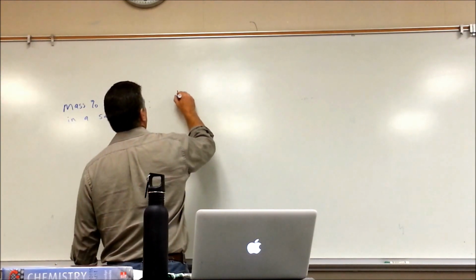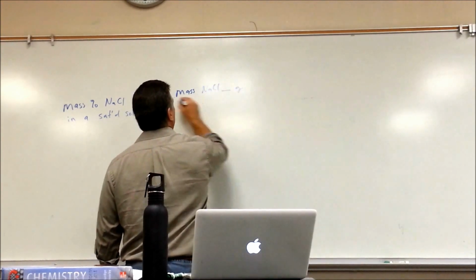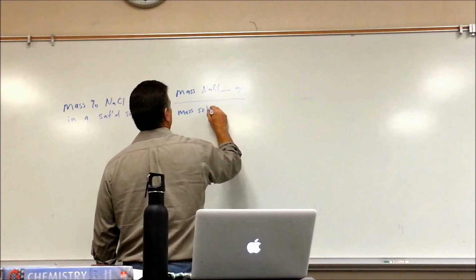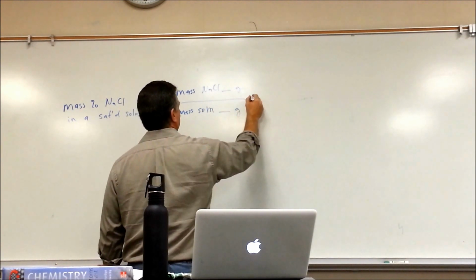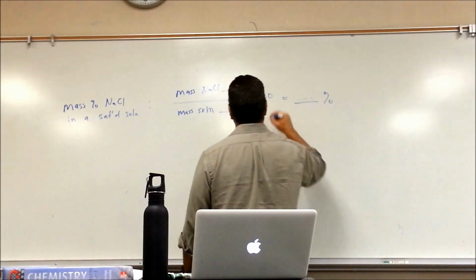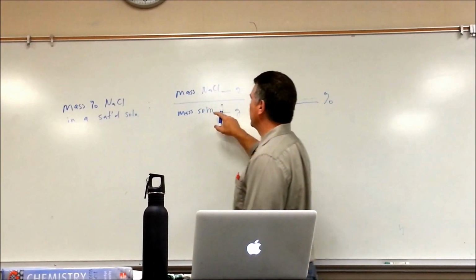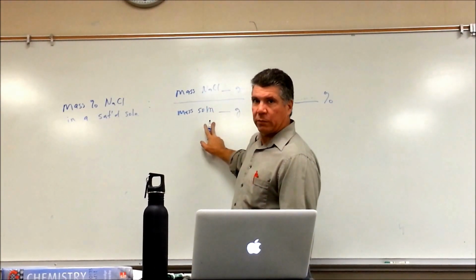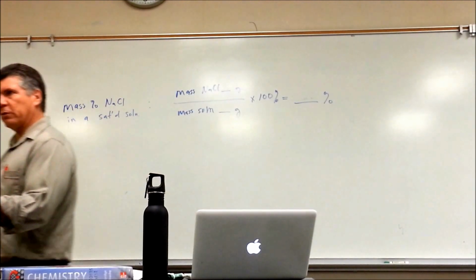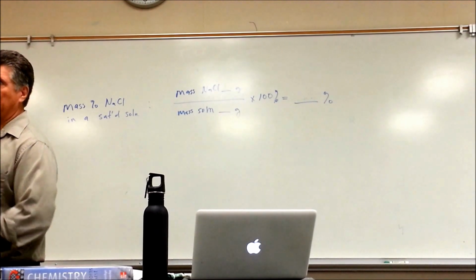In your calculation section, it should look something like this. As I mentioned a minute ago, after you put approximately 6 mL of the solution into the dish, you subtract out the mass of the dish from that mass, and that's the mass of the solution.